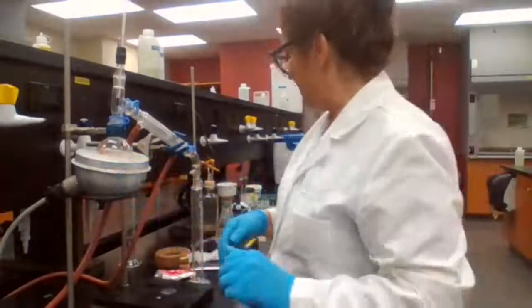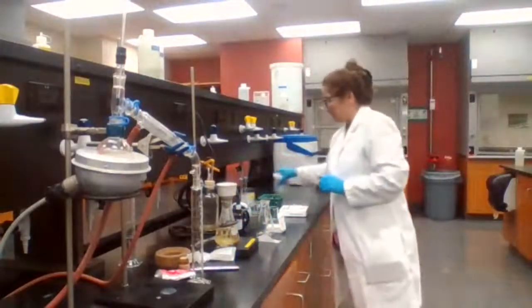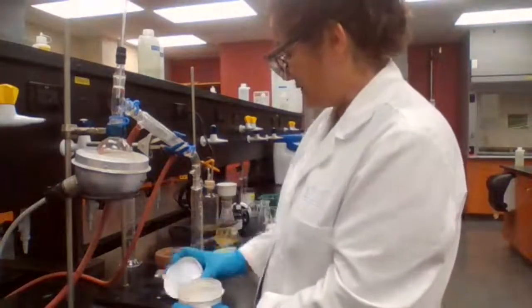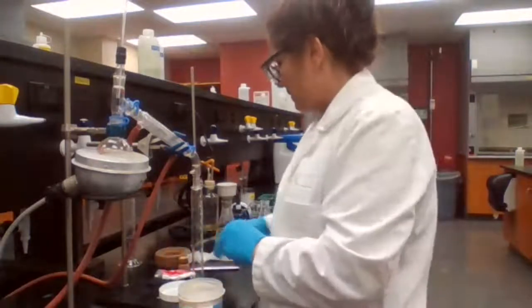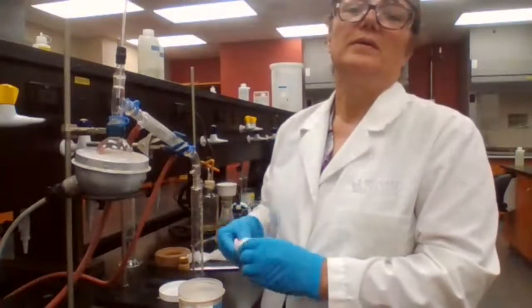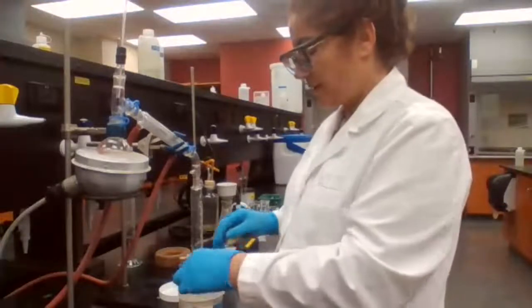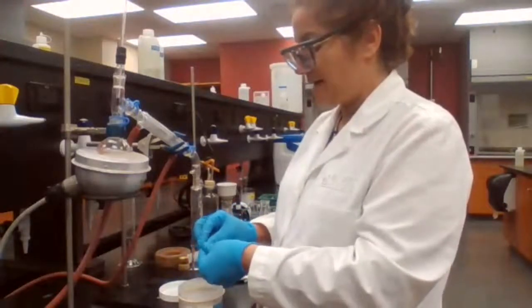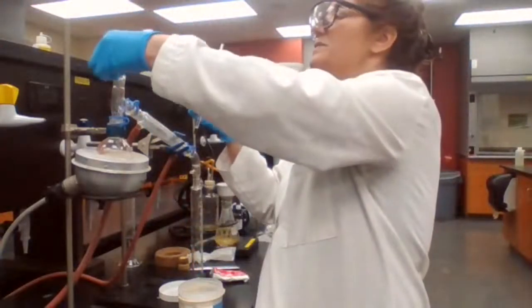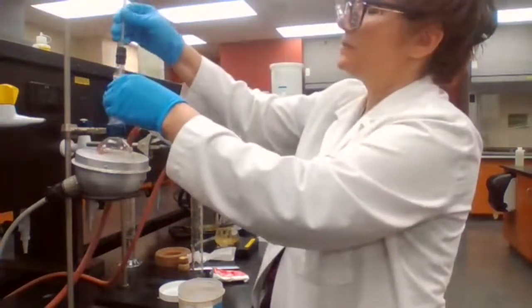Is there anything missing from the setup? Did I add the boiling chips or no? I didn't tell you, right? If I didn't tell you, that means I have not added them yet. So I'm going to have to add the boiling chips. About 2 pieces of boiling chips is good.